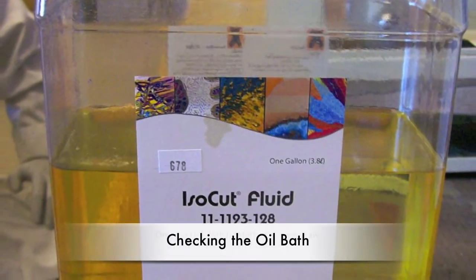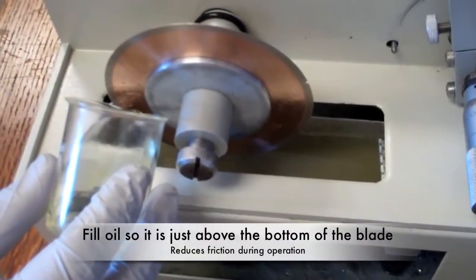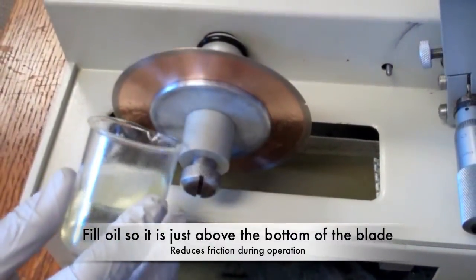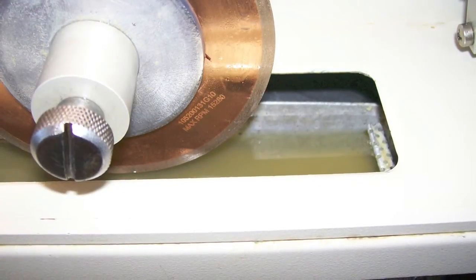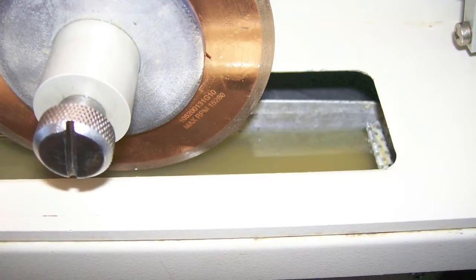Next make sure the oil is at the proper level. From the one gallon container add the oil to a beaker and then add to the oil bath. The oil level can rise just above the bottom of the blade. This will help reduce friction and heat when the instrument is operating.